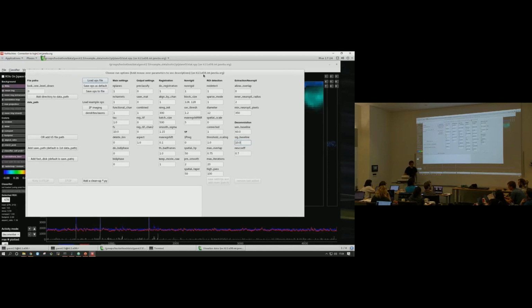Yeah. When Suite2P spits out the F.npy, that was not corrected? No. So if you're going to subsequently use that data, you have to include that in your analysis. Yes. So it spits out both an F and an Fneu.npy. So there's two matrices. They're exactly the same size. And a third one, that's the spikes.npy, also the same size. So all these three are just as big, neurons by time.